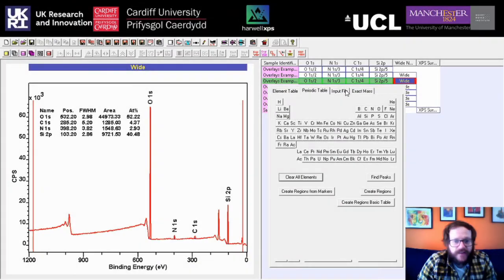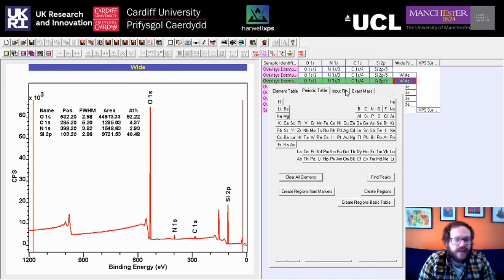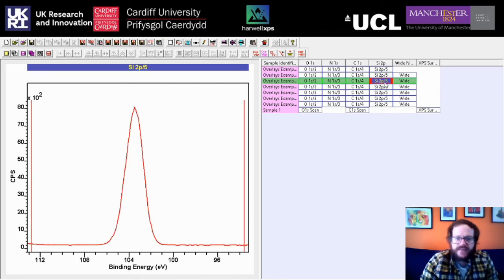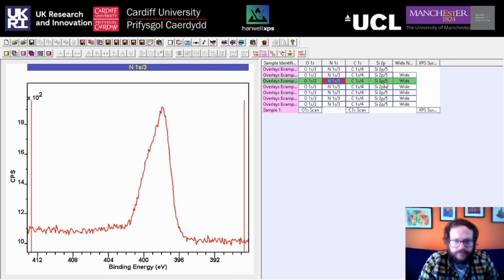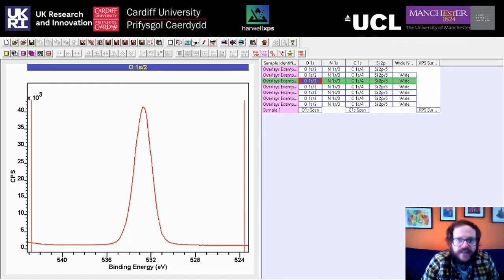The wide scan covers all energies in your spectrum but doesn't use particularly high energy resolution, otherwise the scans would take a very long time. That's why we record high-resolution scans as well, so we can get more detail and a more accurate picture. Now we're going to open up one of the most important tools in CASA XPS — the Quantify option, or F7.